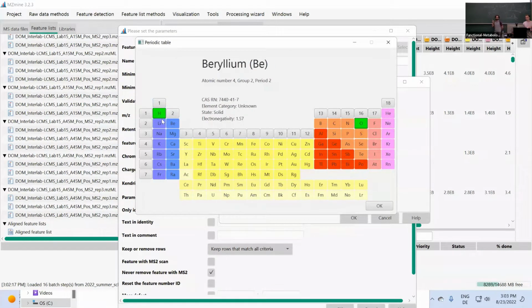We did this before, just on the feature level, not the feature list level. Again, we can have some shifts due to overlapping signals in the m/z range, and we can also have weirdly distributed isotope patterns. So it just makes sense to do multiple feature filtering steps. It's just a different thing a bit.